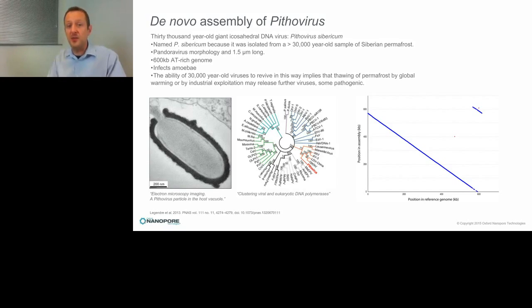I don't have any alignment metrics for this one, but I don't think they'd have been especially good, since this was done before Nick and Jared Simpson had finished their polishing tool, Nanopolish. But this brings us nicely to the next slide.